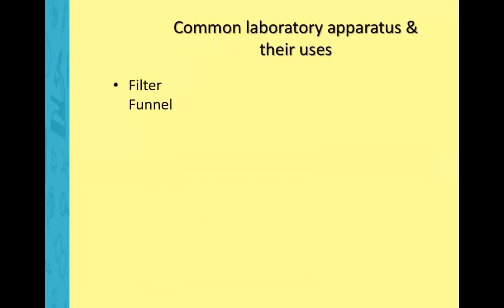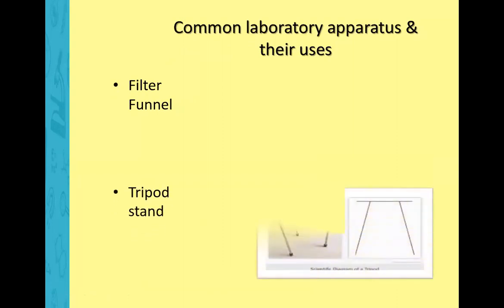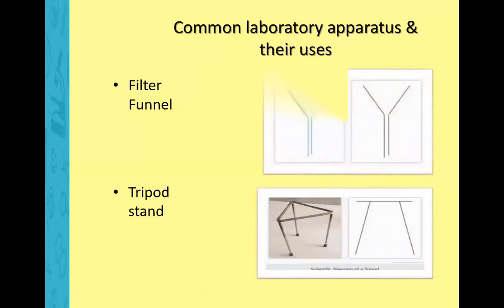Next is filter funnel. There are two pictures in this slide. First one is the filter funnel. Filter funnel is for separating an insoluble solid from a liquid.